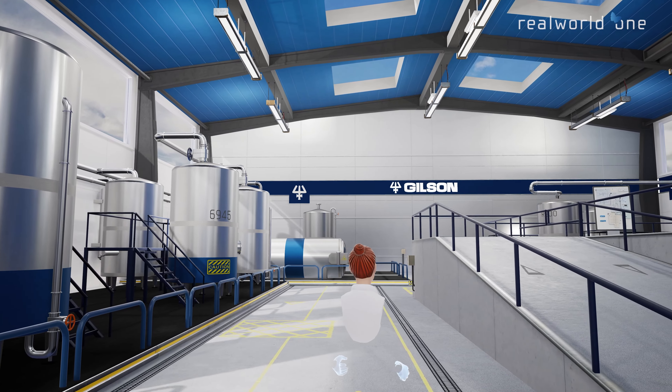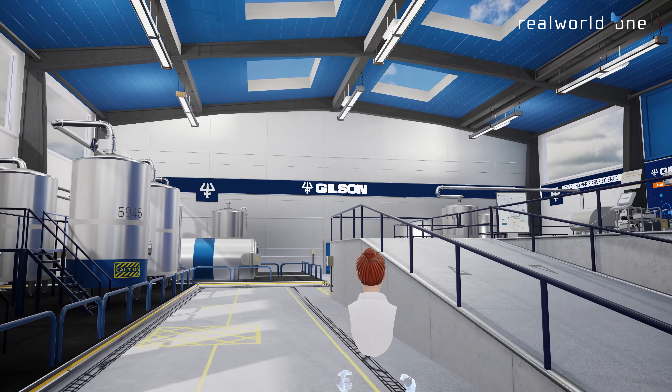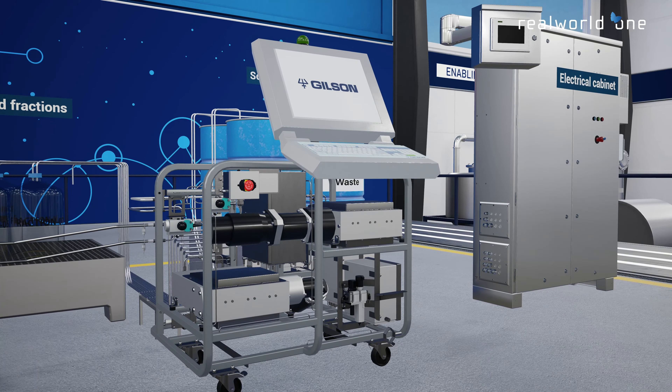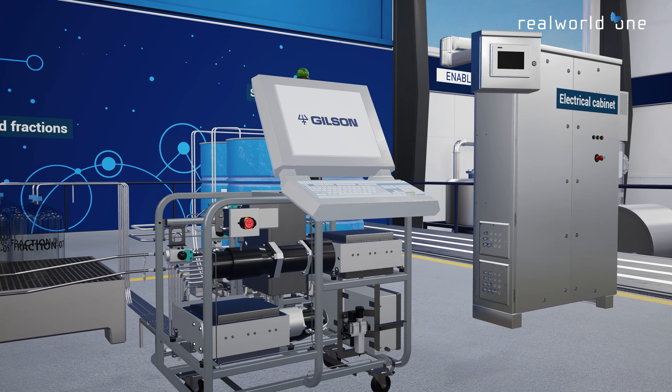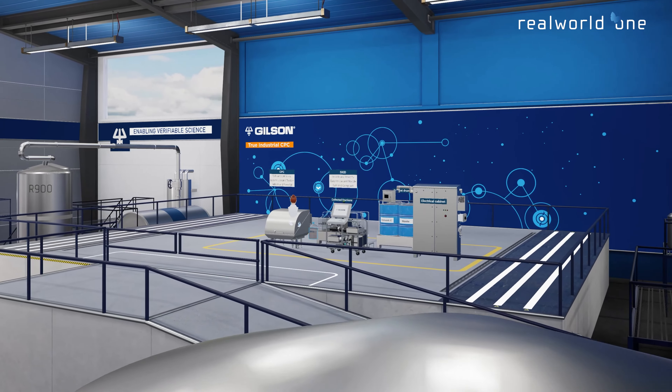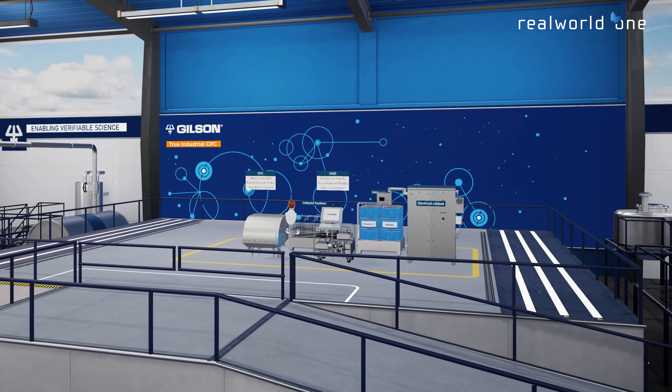Welcome to Gilson's Virtual Reality Showroom. Let's explore the Verity CPC Process System, the leading device for silica-free chromatography for process-scale molecule purification and extraction in pharmaceutical, cosmetic, food, and natural extract industries.